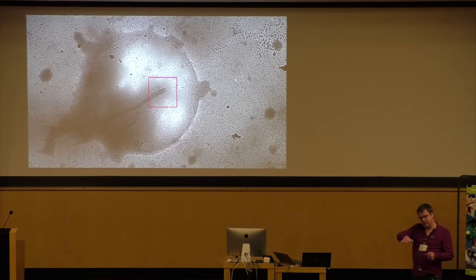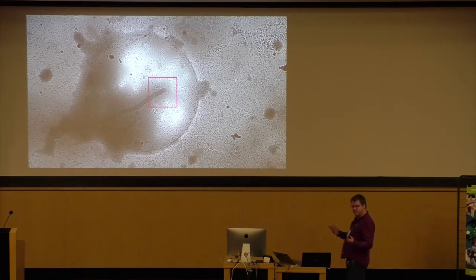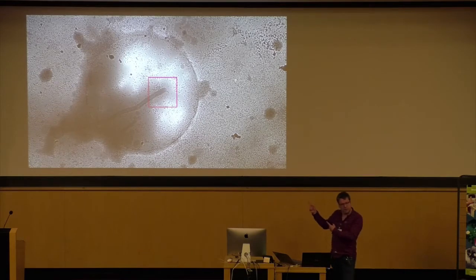So it would take a low mag image, we go to high mag, we do the first branch, and we only went up to 45 degrees, 20 electrons dose. You come back to 0, and then you do the other side. That movement is after 20 electrons per square angstrom dose, after that first branch from 0 to 45. It didn't happen everywhere, but in a lot of places on this particular sample.